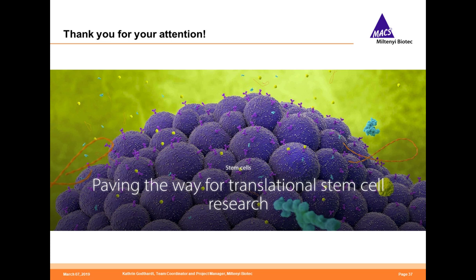Thank you. The next one is, is the ACC process also applied for umbilical cord or adipose tissue? Yes, it's possible to use the ACC process also with these starting materials. Of course, the enzymatic digestion of umbilical cord and also adipose tissue has to be done manually, so this cannot be done within the process. But after you have your single cells, after enzymatic digestion, you can enter the Prodigy process and start the whole cultivation process.